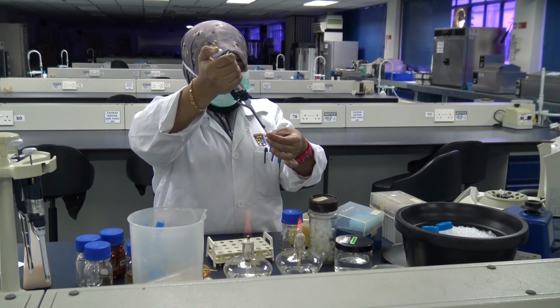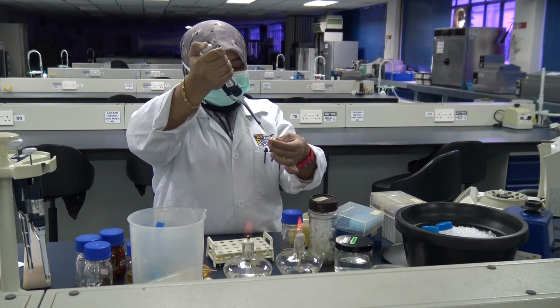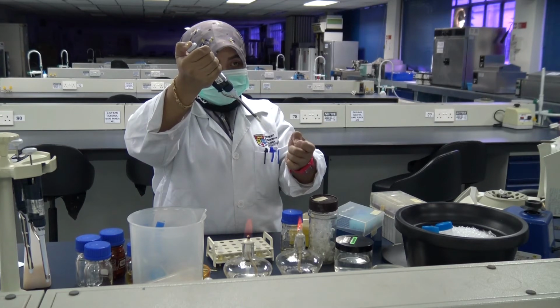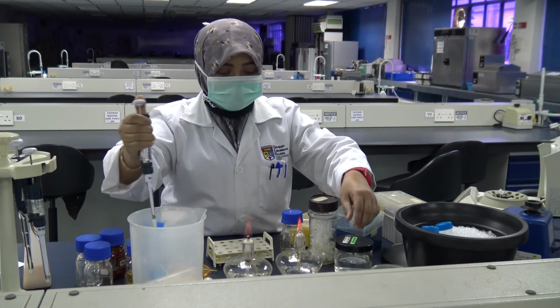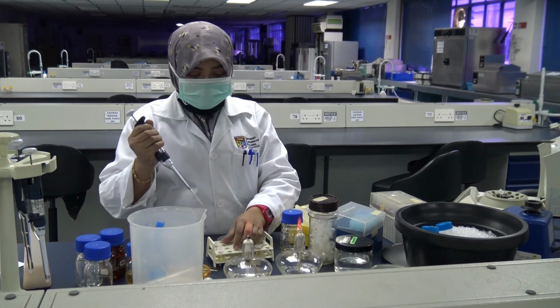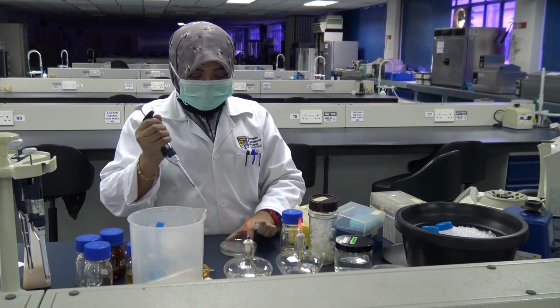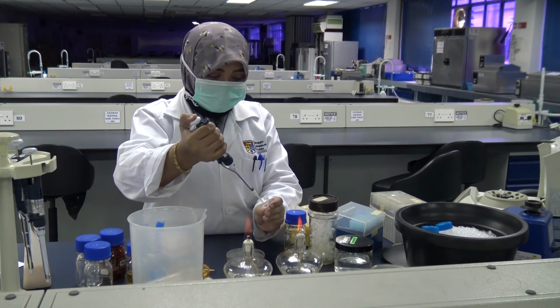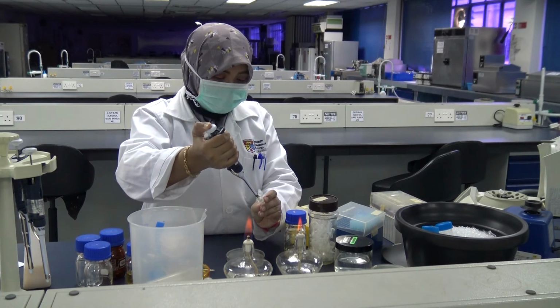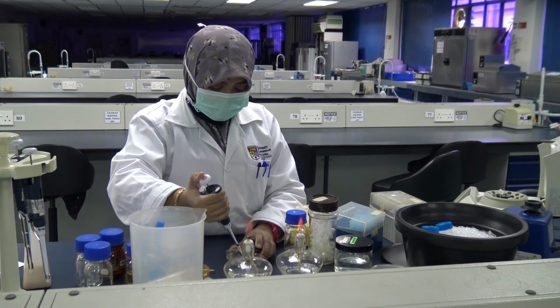So the colonies that will grow on this NA plate containing 10 to the power of 0 cells, this is on an NA ampicillin plate. So this will be transferred onto NA and ampicillin plates. So we move everything, this is about 100 microliters. Remember, we have already spun down all the cells from one tube, and now it is being transferred onto nutrient agar ampicillin plates.